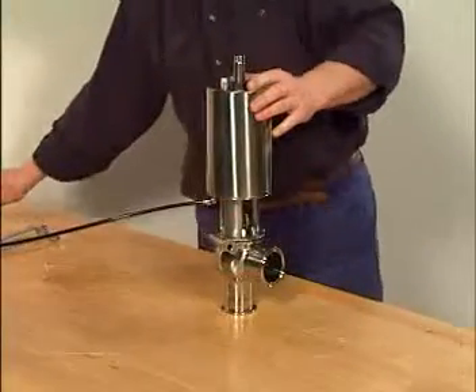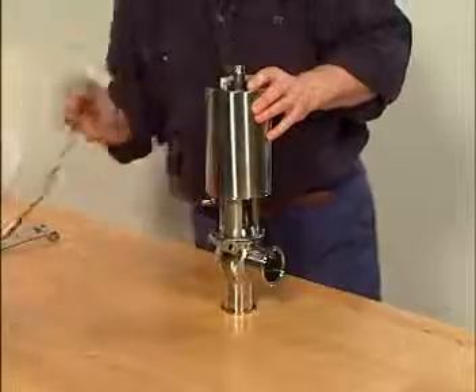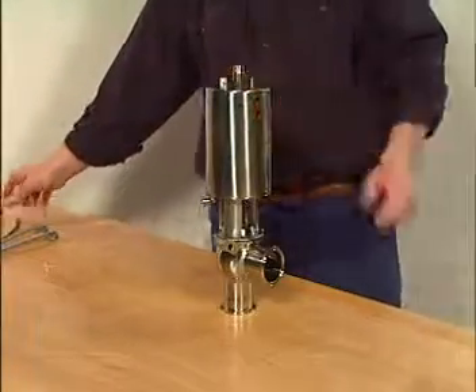Release compressed air to the actuator. Activate the valve a couple of times to ensure correct functionality.